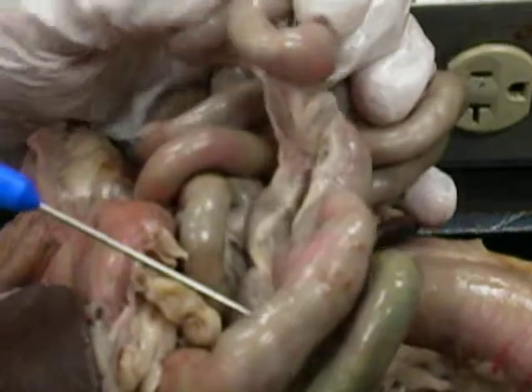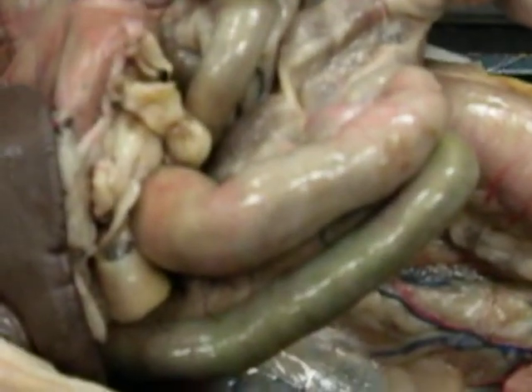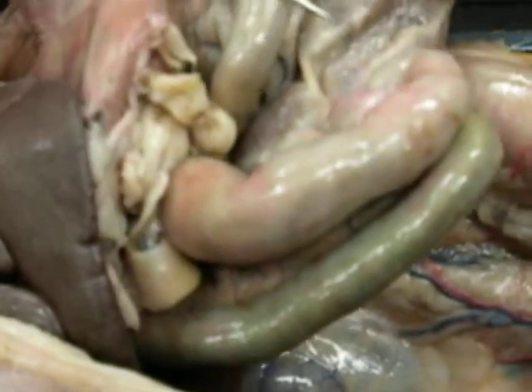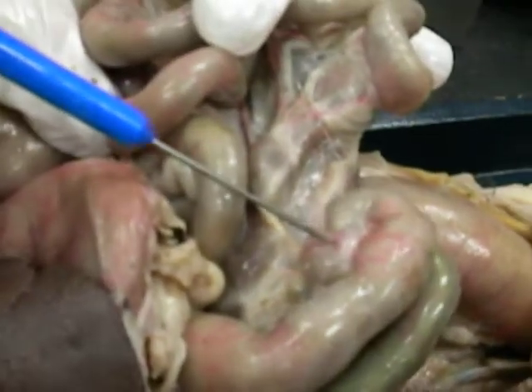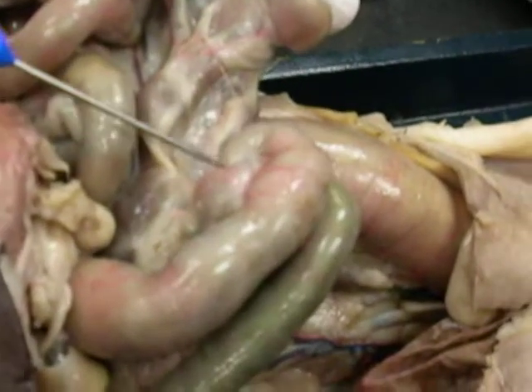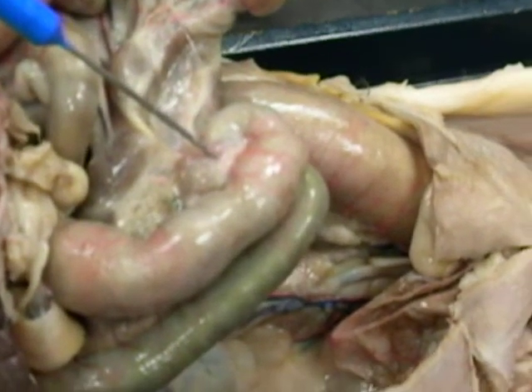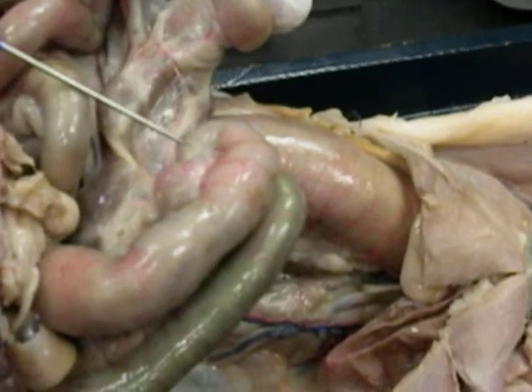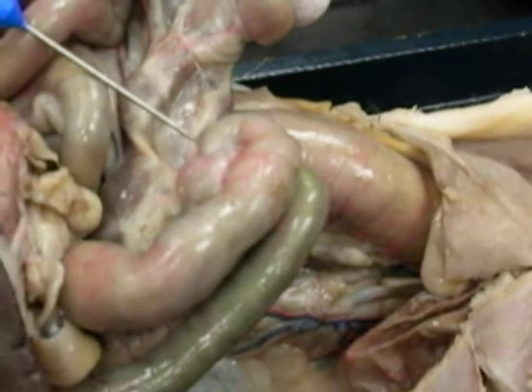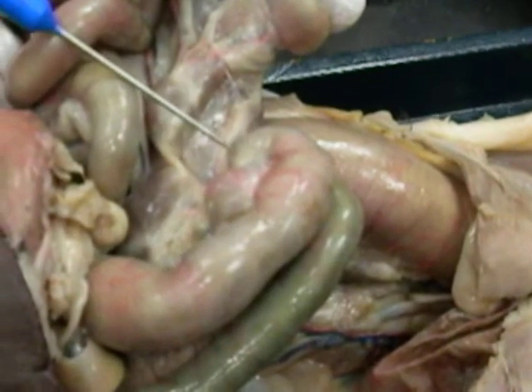Now, for the large intestine, we really can't see that ileocecal valve because it's on the inside. So we're going to put the pin as close as we can to where the ileum and the large intestine meet, which usually is this nodule that's here. So we'll probably put the pin through that nodule and that's going to be the ileocecal valve. Now on yours, your cecum has curved quite a bit. So the cecum itself would be this blind end or dead end right here. So that's the cecum.